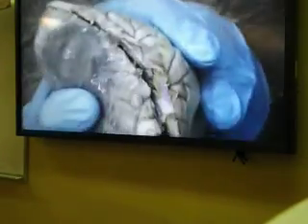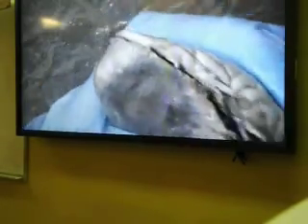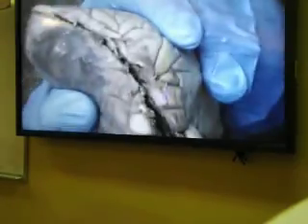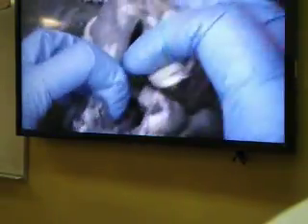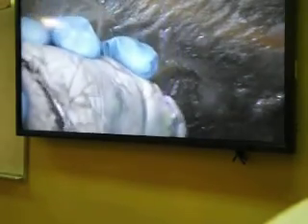You have to go through more than once. The left side is thicker than the right side. And a little bit more. Again, be careful that you do not cut your hand.